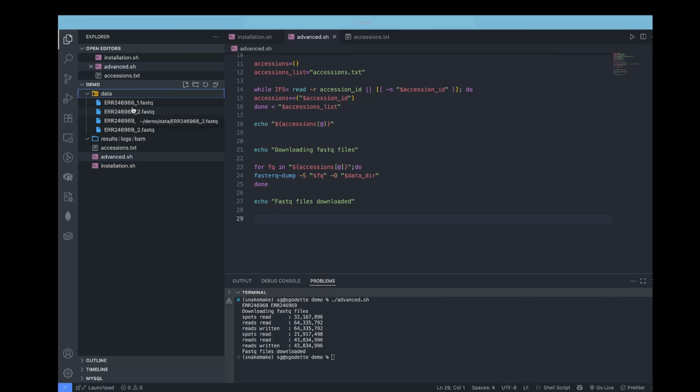That is why the bash script code that we saw in the first sections of the video cannot help us here. And at this point, we will now shift to working with a for loop to iterate through this data directory and then run FastQC on each and every one of those files. We simply need to write for maybe FQ in, and then we want to access the data directory. To do that, we simply can just copy this here.